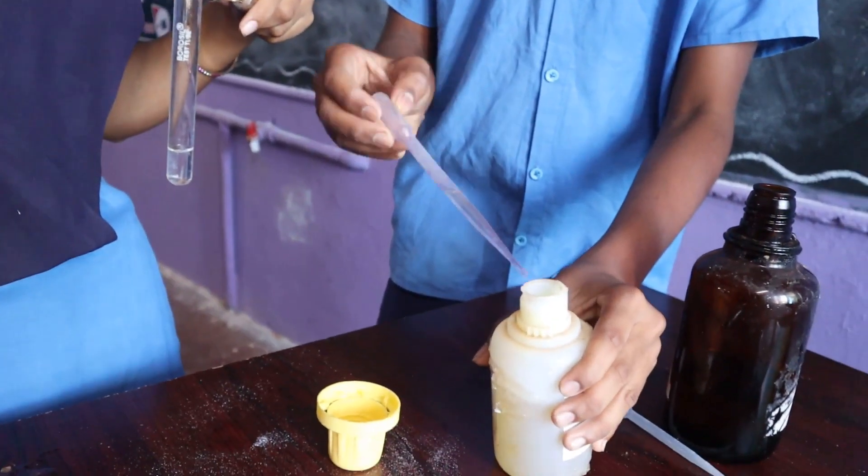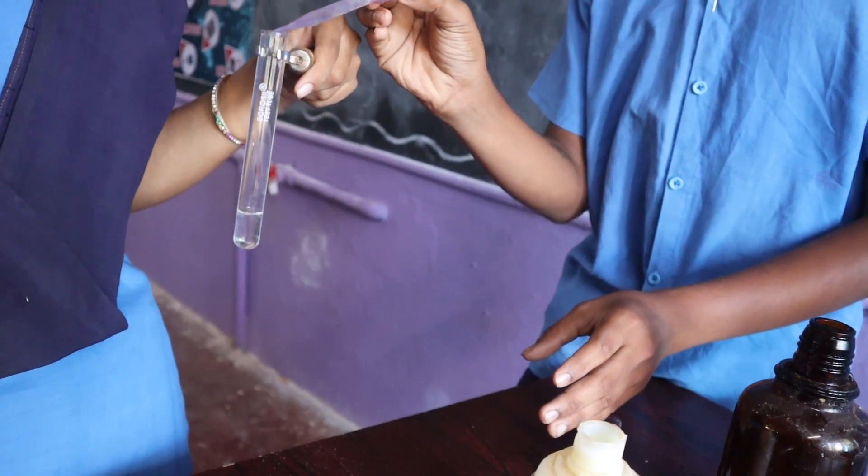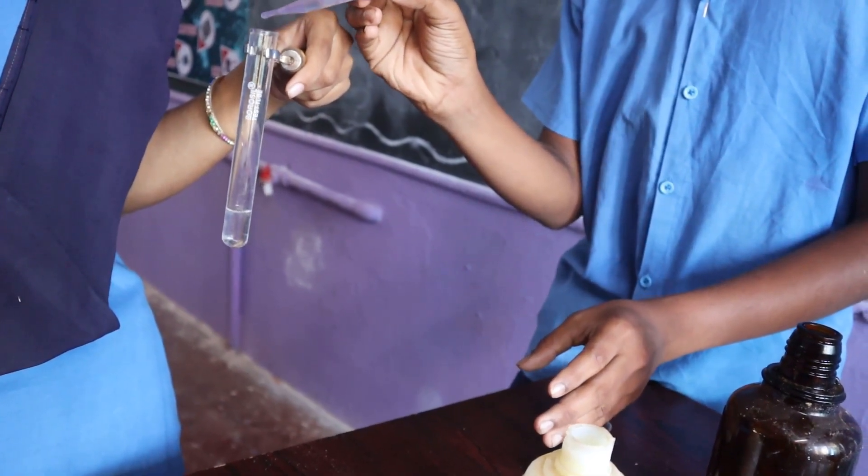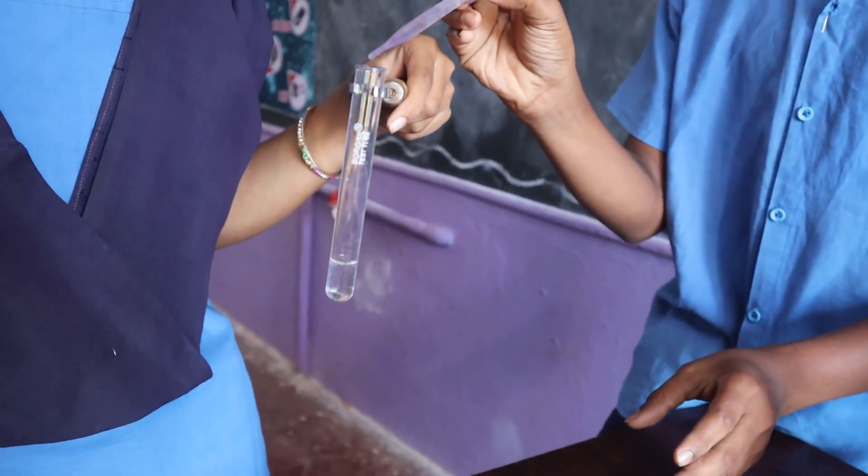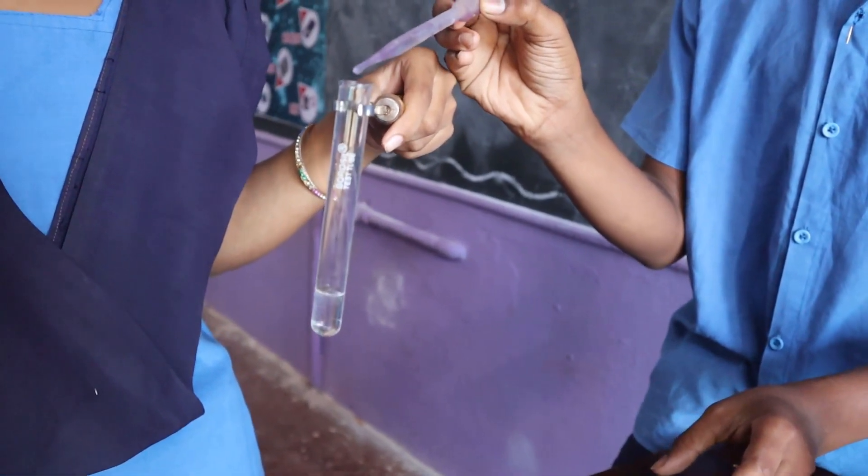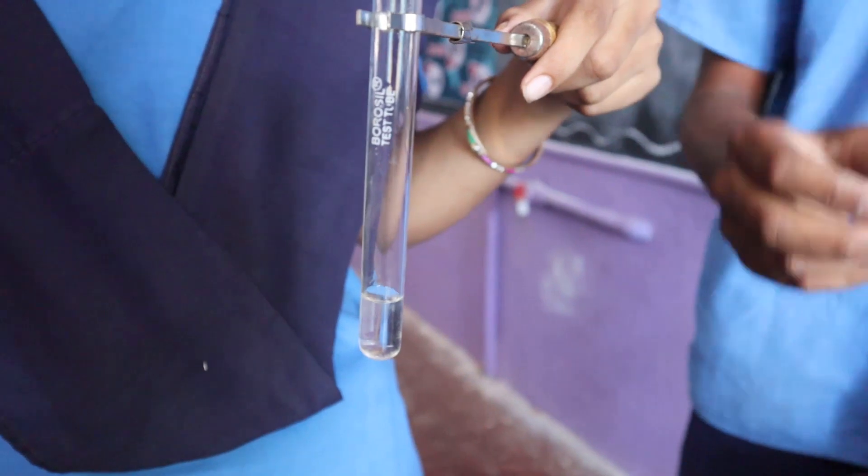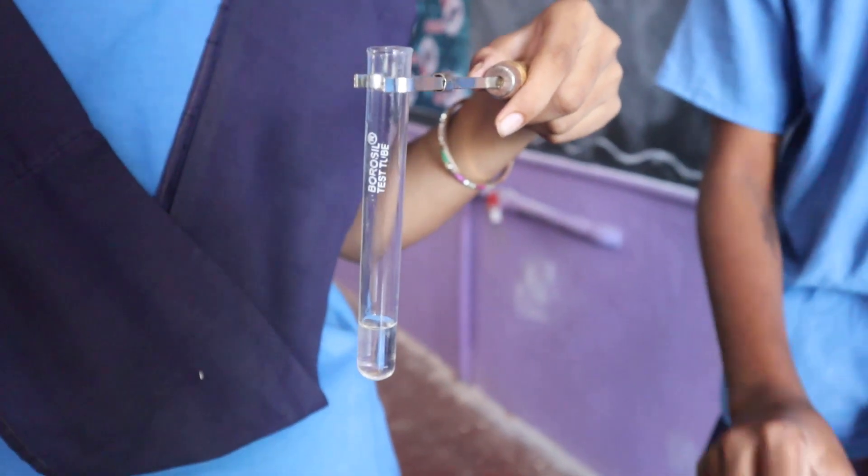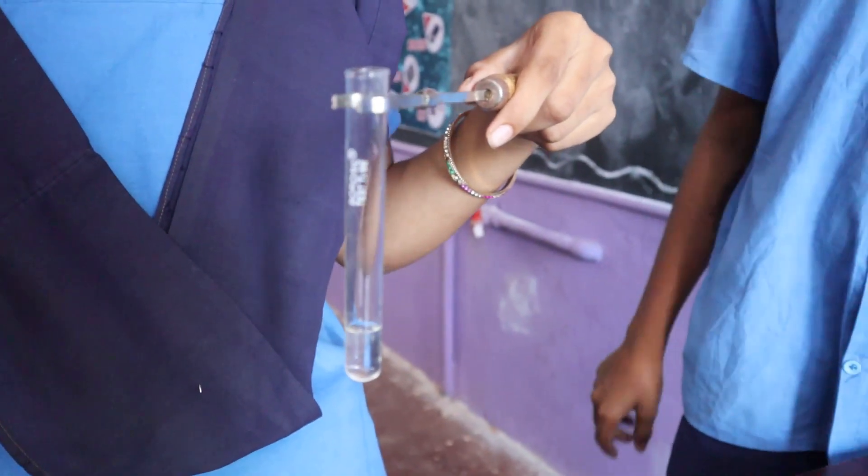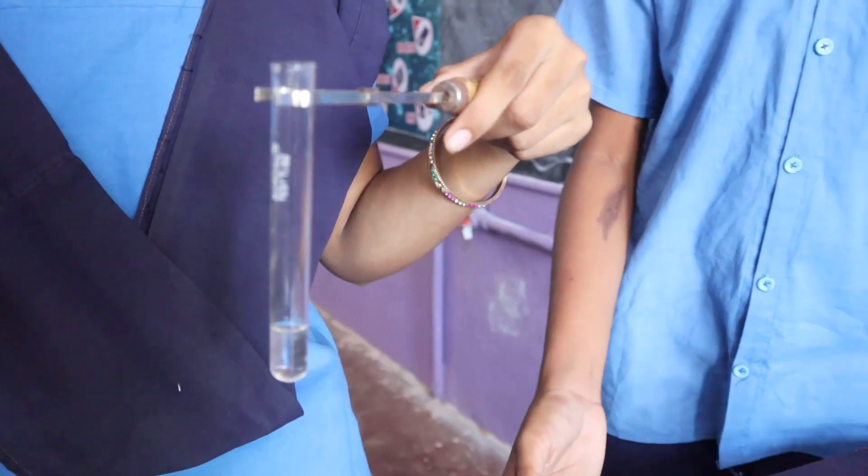Add a few drops of phenolphthalein indicator solution to the acid and observe its color. We notice that there is no change in color. From this, we can say acid solution shows no change in color when phenolphthalein is added.